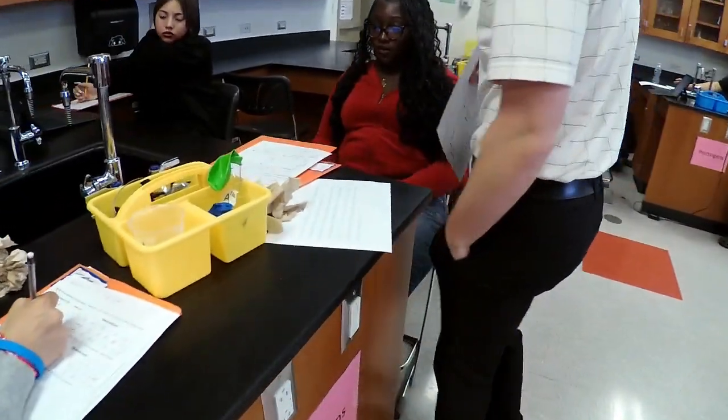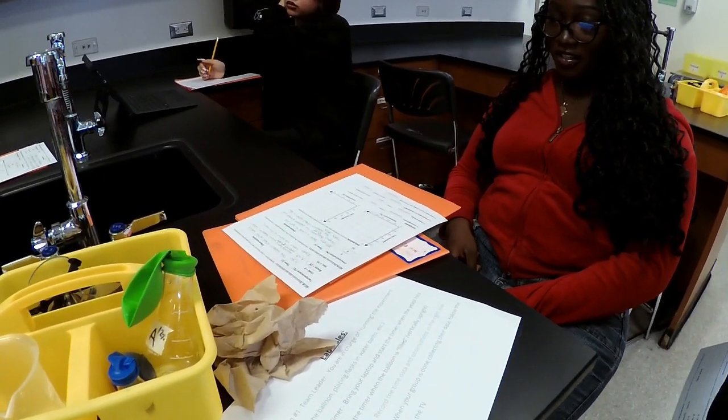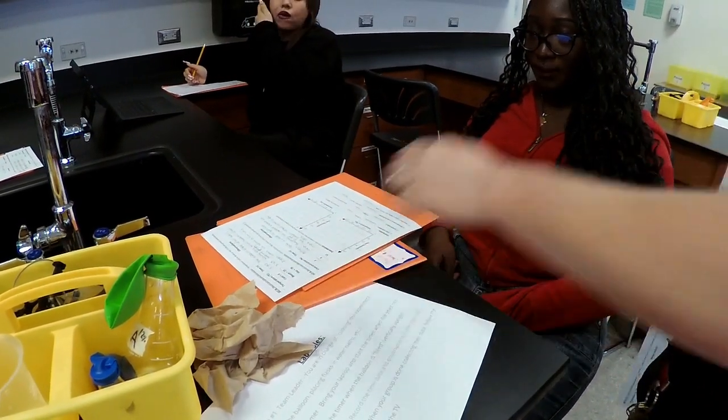And then do we notice a trend for concentration overall? The lower the concentration, the longer it takes to rise. Okay, awesome. And we see that throughout the data here. Yeah. And then what about temperature?